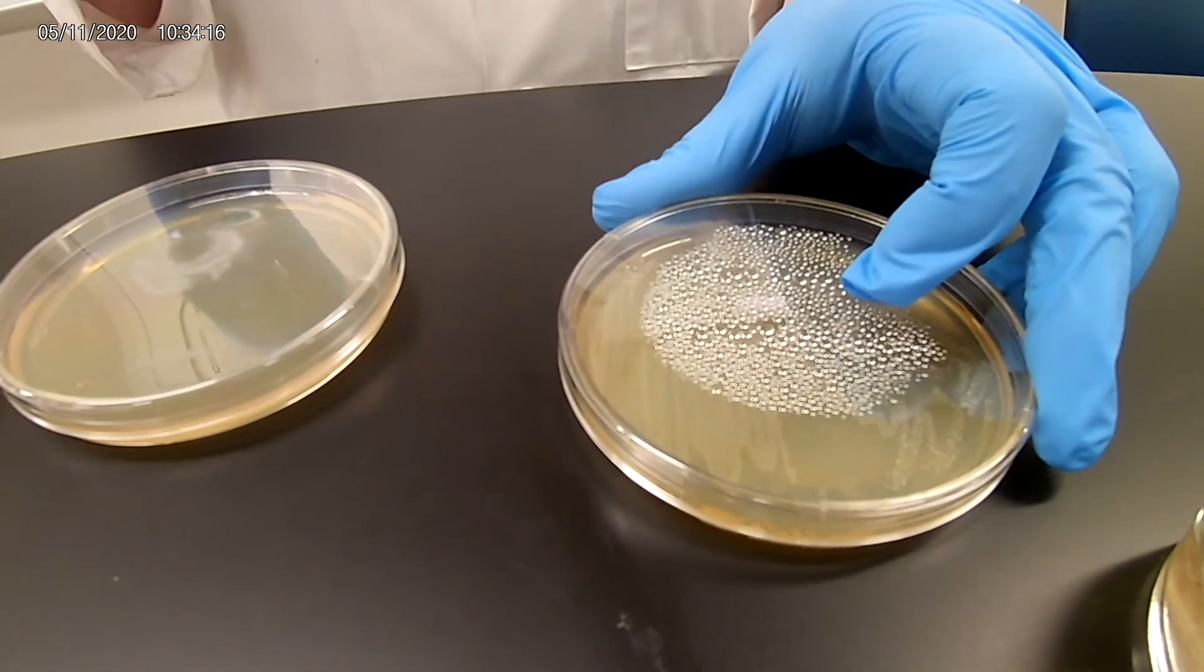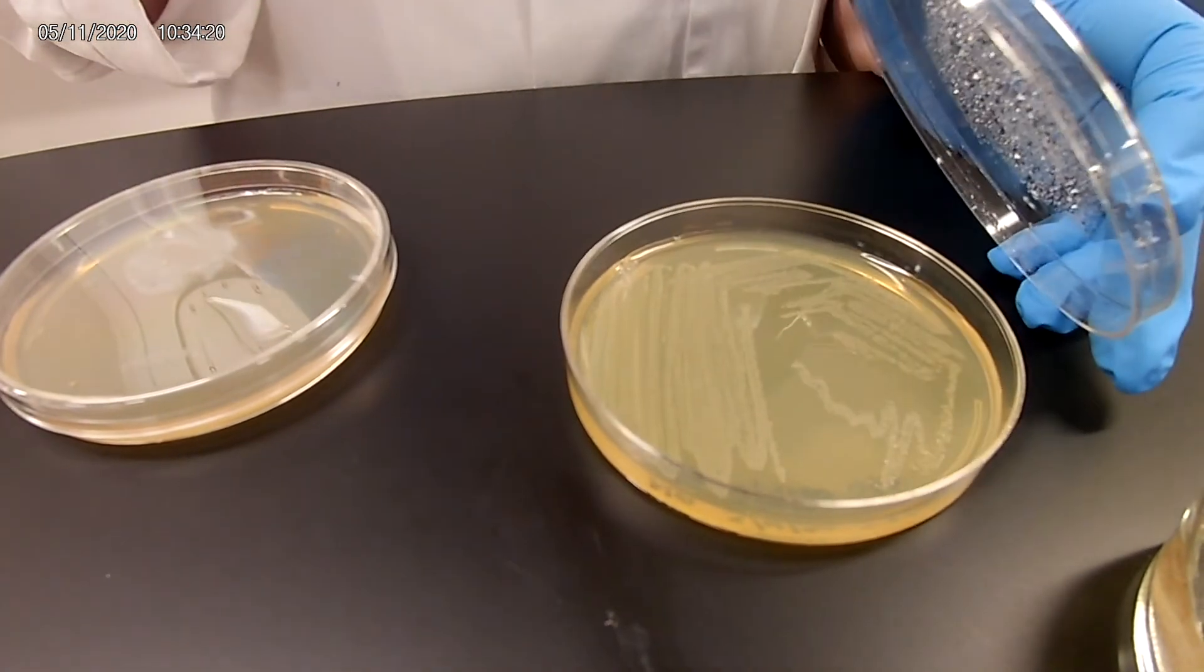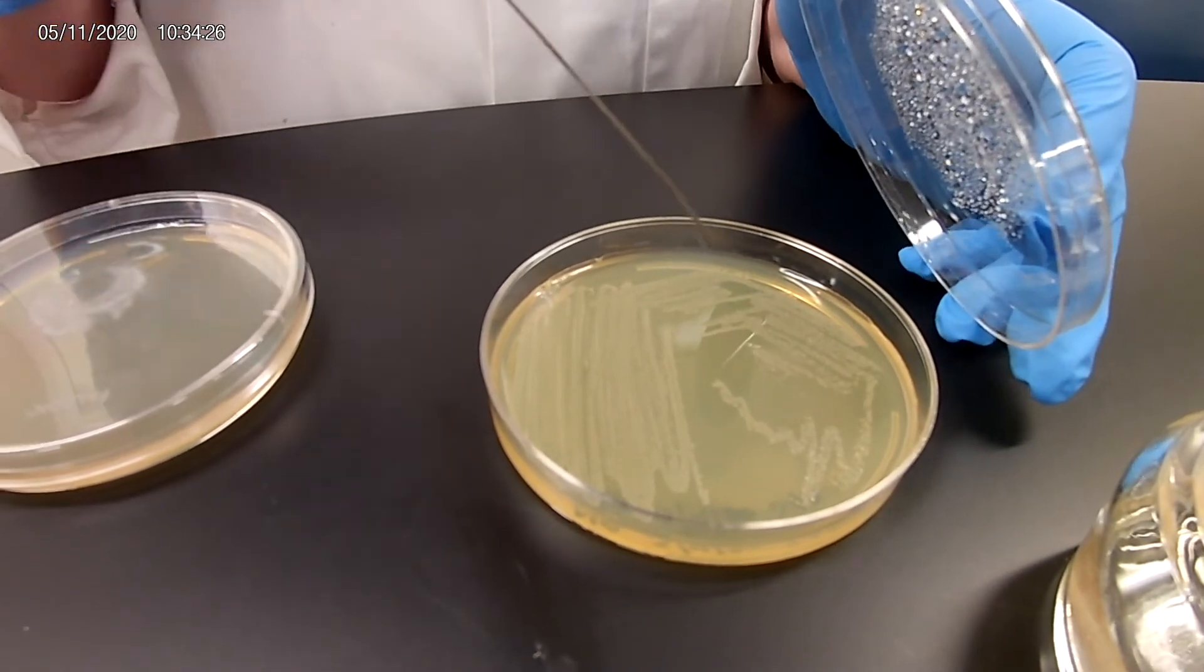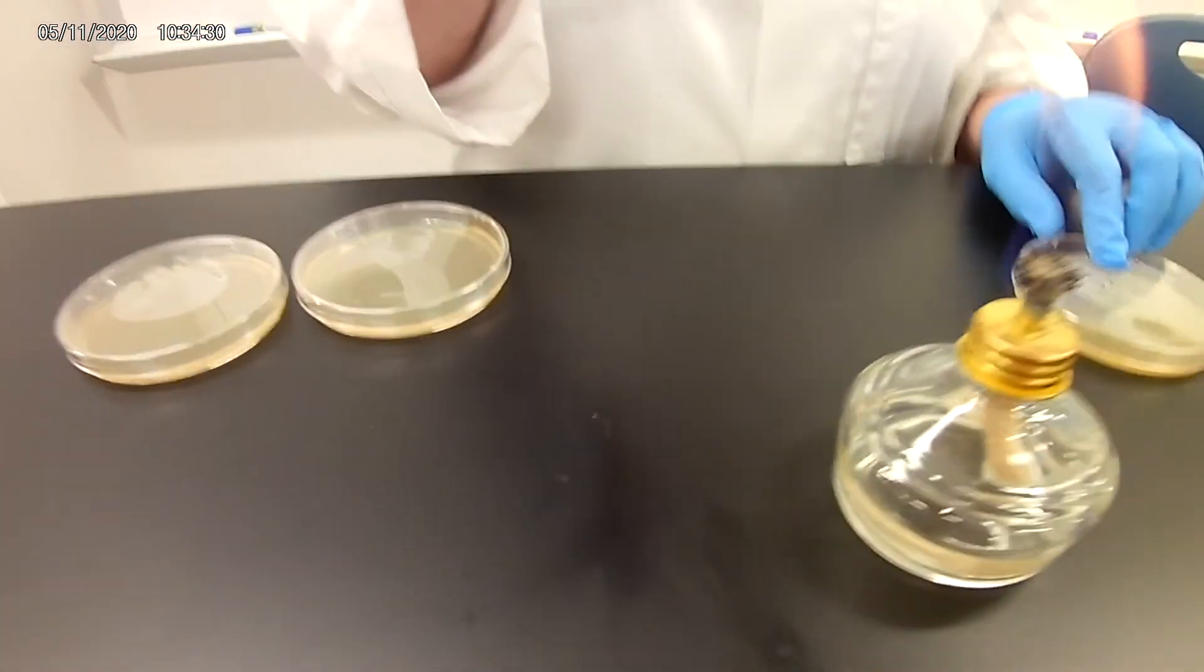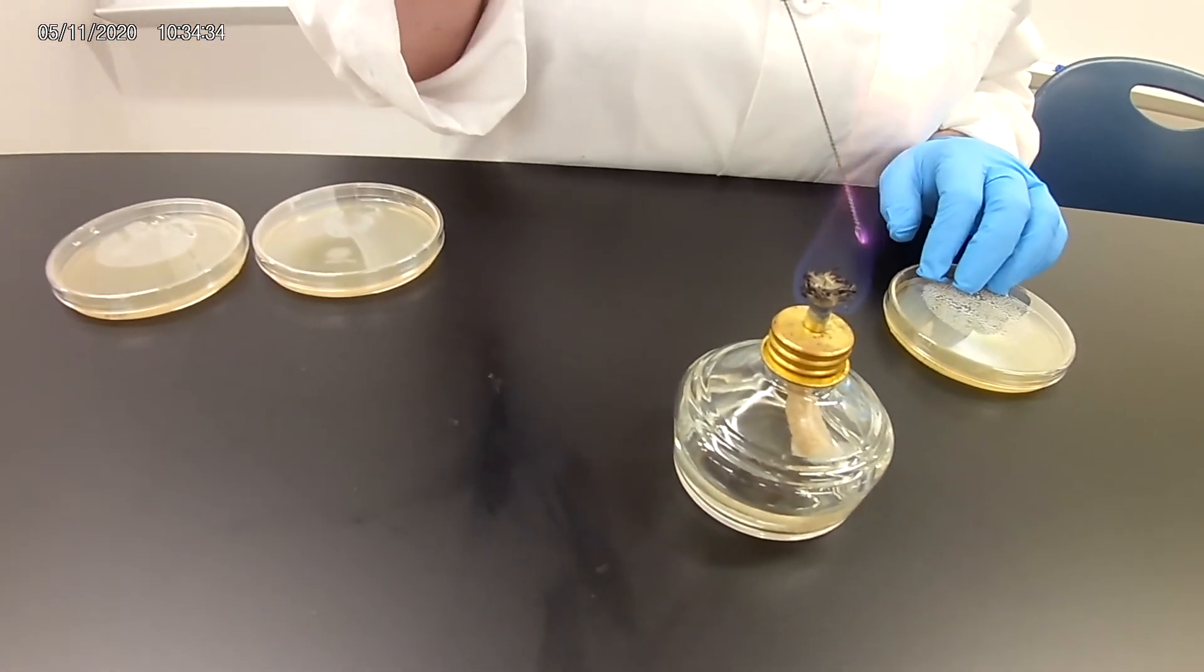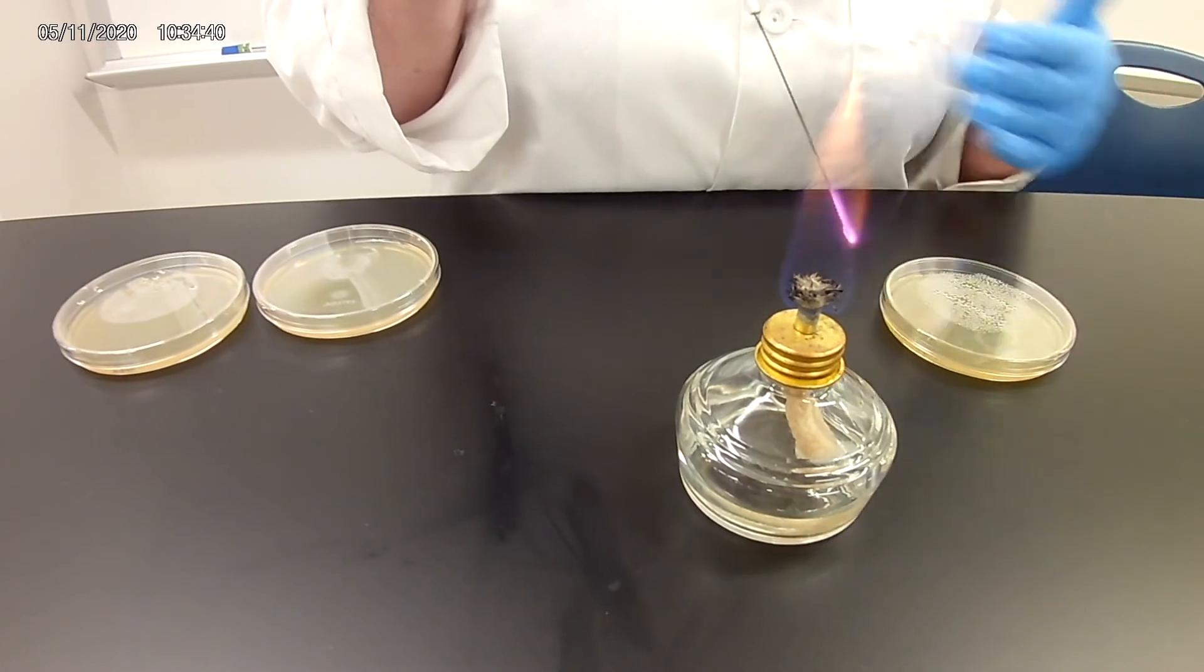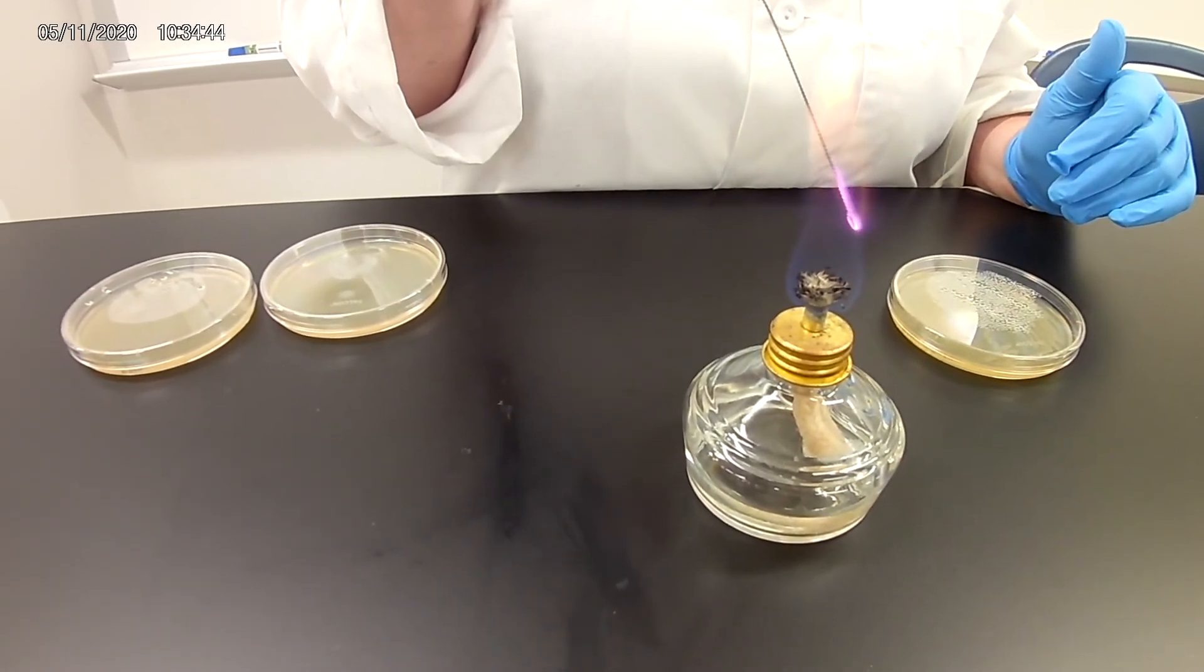If you look at the original stock plate, both of our new plates are ready. You can see how heavy inoculum here, and it's spread and thinned out as she had continued on. Now this plate was not done for streak isolation, it was just to subculture, but you can still see how it is streaked. You're essentially diluting or spreading the bacteria out. You want to be able to get to an individual colony.